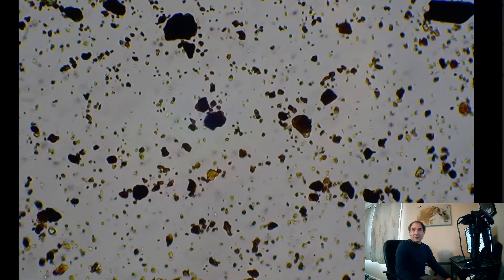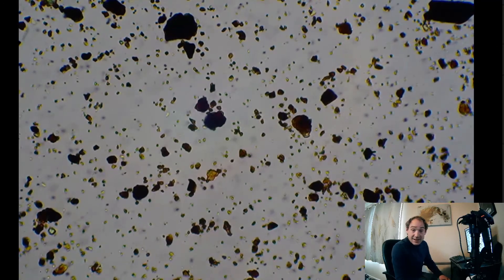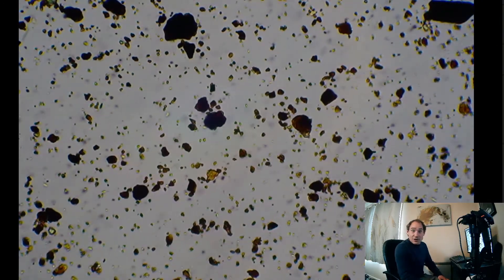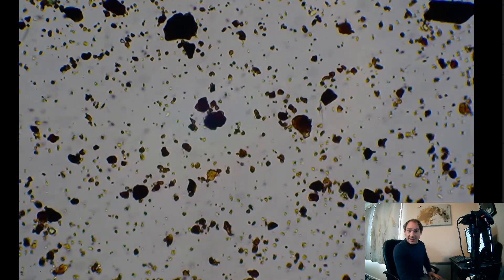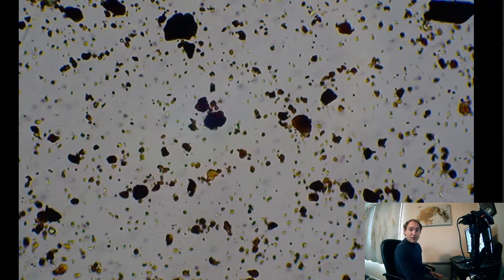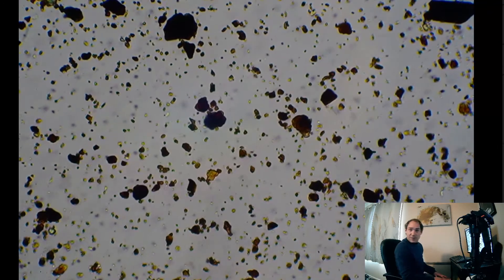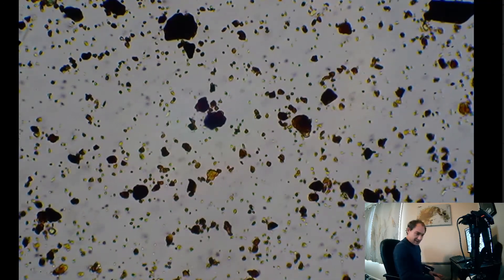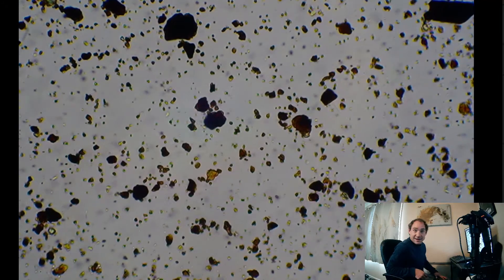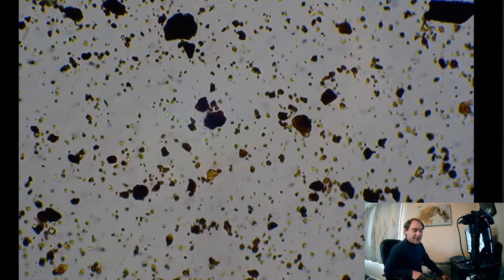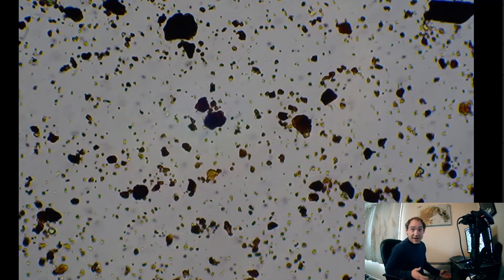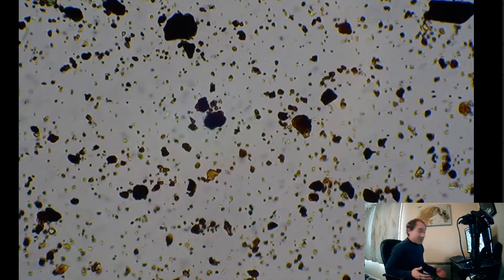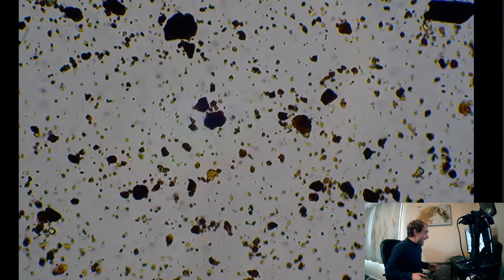Welcome to Shooting the Soil. Today we're checking out Rejuvenate from AEA, which is a microbial food. We're feeding the microbes in our soil, not necessarily our plants, because the microorganisms can feed our plants a lot better than we can, and then we don't have to worry about all that NPK stuff.